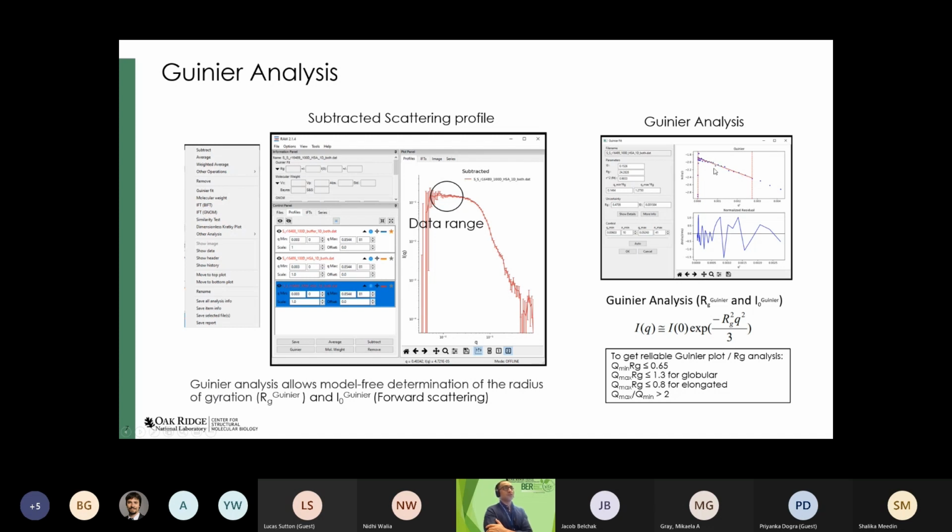That tells you the sample is not monodisperse and has some degree of aggregation, and depending on the level of aggregation, you cannot really analyze the data, but it's not always the case. Like I'm going to show you, you can do some comparison with crystal structures and see how the overall profile looks when you do the fitting with your model.